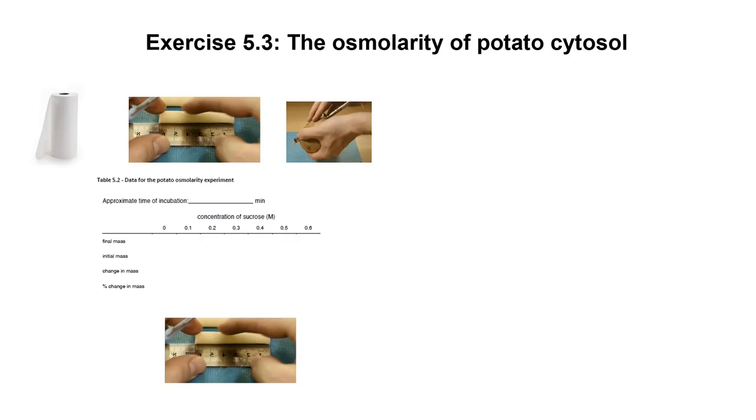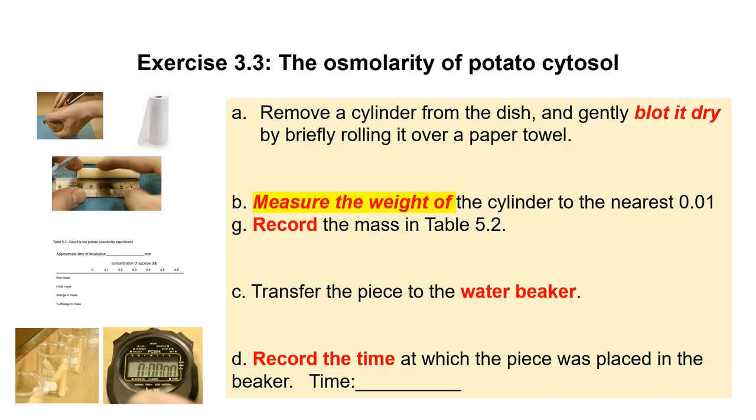At the end, if we are in person, we will not measure the length. We will measure the weight, and I will show you how to do it. However, if we cannot do this experiment in person, you can do it just measuring the length. Something important about this experiment is that you have to wait some time. So I recommend you start this experiment first, and then you can start observing things in the microscope. While you set up this experiment, you can wait the 20 minutes while the potatoes absorb all the sugar.